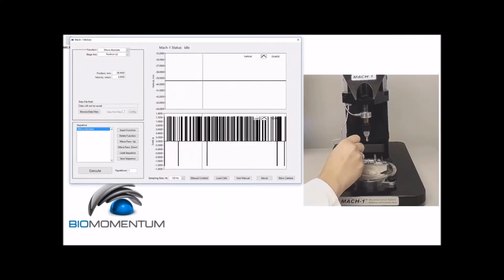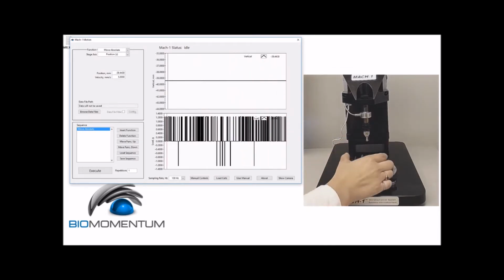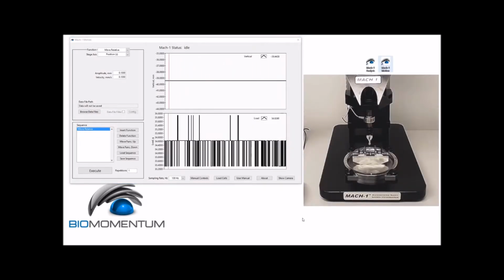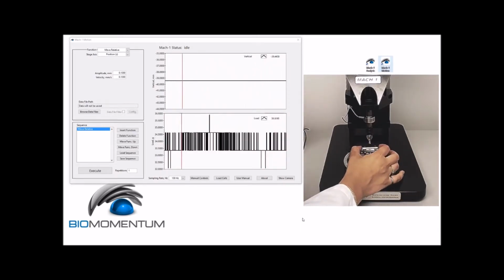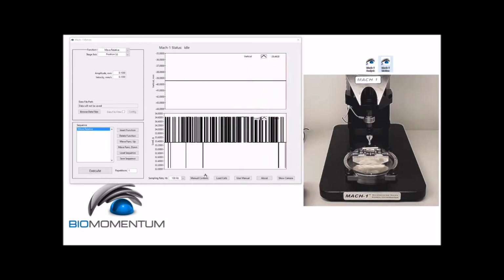Adjust the distance of the pins by sliding the 3-point bending supports after unscrewing their securing screws. Report that distance as the span length. Then reposition the wood sample on the supporting pins and make sure that the sample is properly aligned, since improper alignment may result in a non-uniform stress distribution along the cross-section.